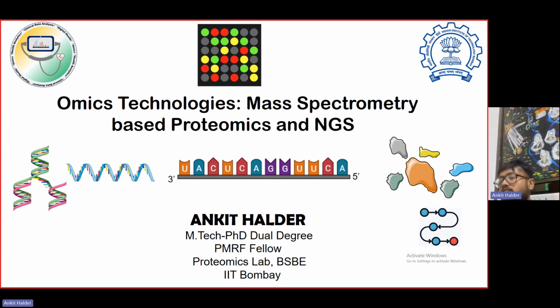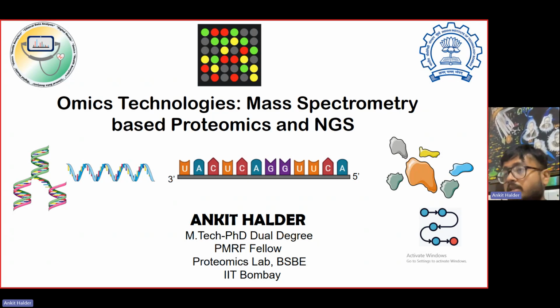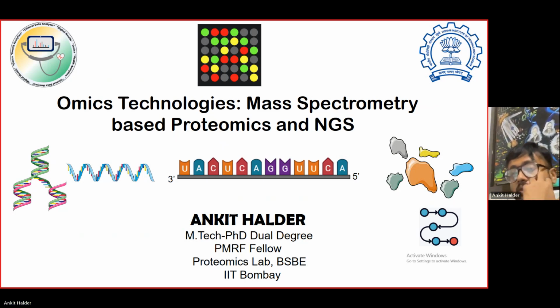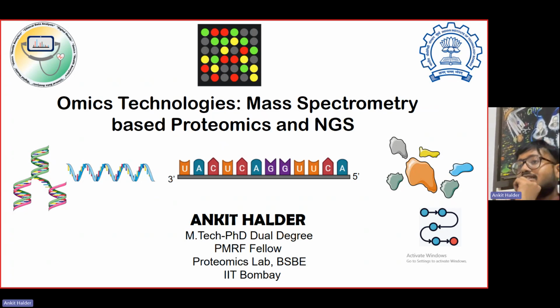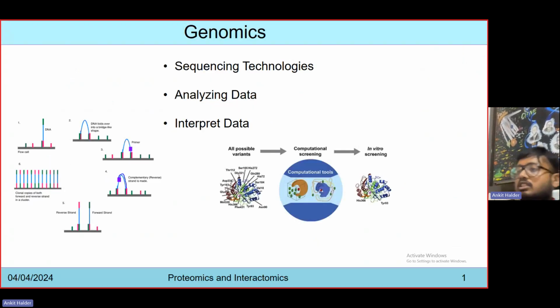So definitely what we would be doing today is looking at the different genomics technologies, some of the repositories and portals, and some hands-on on how to understand and analyze the raw mass spectrometry data if you want to find out and identify the proteins. That's why we have started with the omics technologies, the mass spectrometry based proteomics and the NGS. So we will be starting with the genomics.